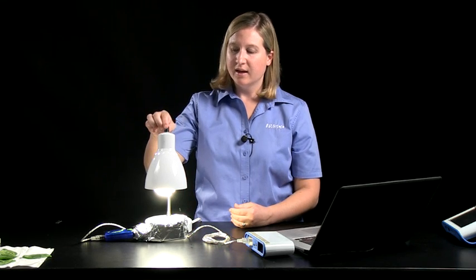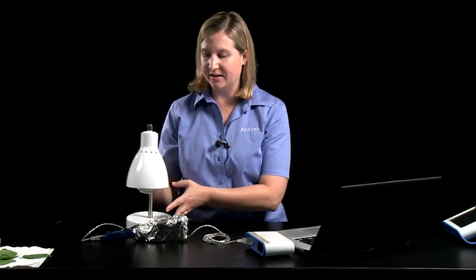So hopefully you've seen from this presentation that providing a lab to your students that gives them direct evidence of what's happening during photosynthesis and respiration can be an easy lab to perform. And one of the reasons I like this lab is not only does it help them understand those chemical equations for respiration and photosynthesis and the idea of carbon dioxide as a reactant or product of those processes, but I also like that this lab lends itself to easy inquiry designed by the students. So they could use the initial setup and change one variable such as the distance of the light to the bottle. They can also compare different kinds of light bulbs to one another. So there's many places that students can go in a way that's designed by themselves to test the effect of a variable on the rate of photosynthesis or cellular respiration.